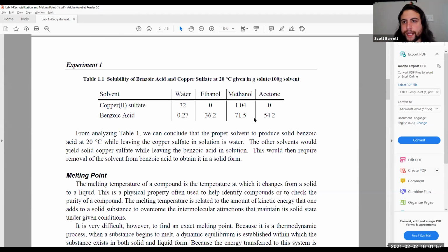We do ethyl acetate hexane mixtures in order to change the polarity, and that way we can separate one compound from another compound. So that's the idea that we're getting here today, is that we can use different solvent systems in order to firstly dissolve a crude mixture, and then secondly to pull out our pure product of what we want out of there.